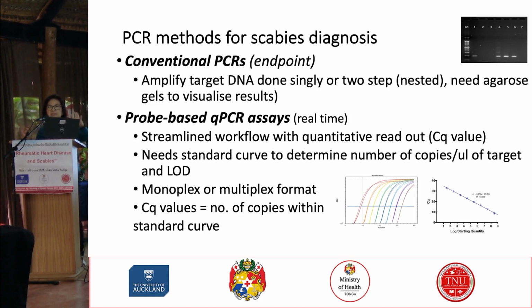And you use a little machine and you stick your PCR mixes in there, and what you see is a visual representation of your results.